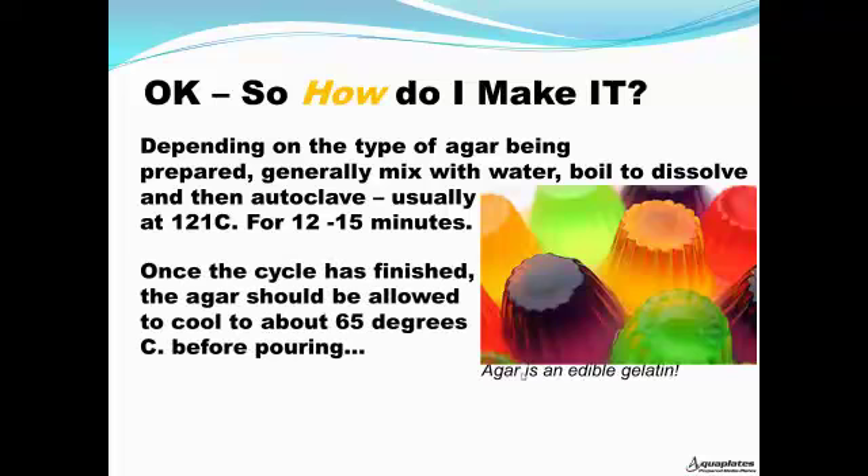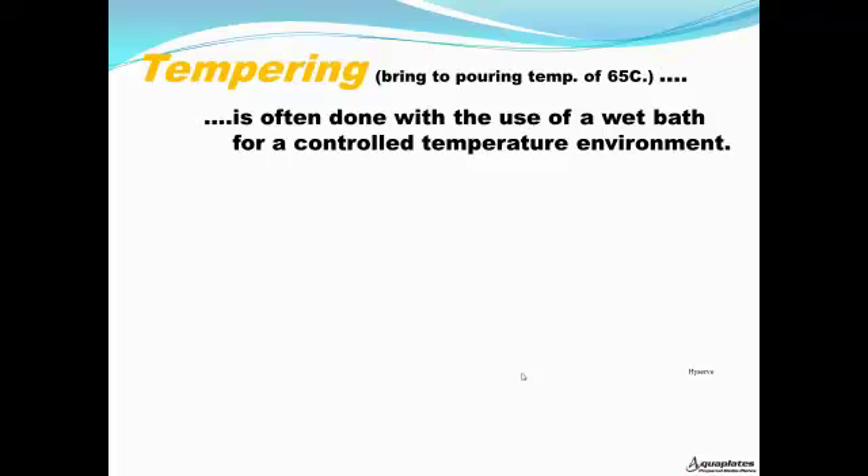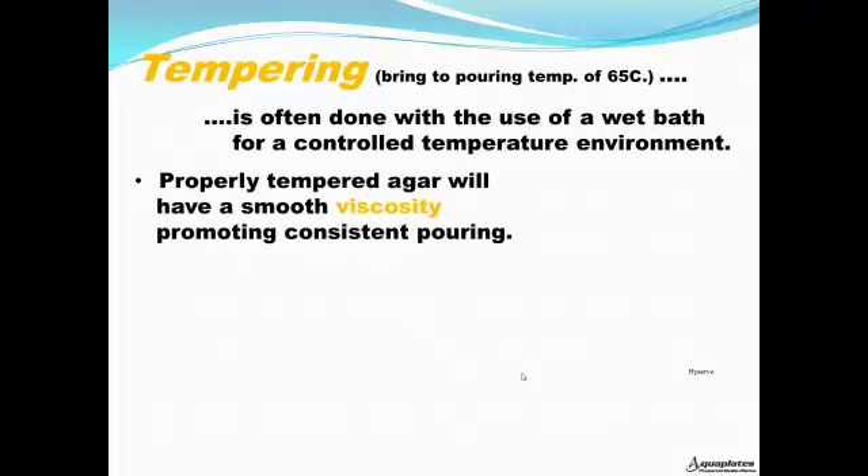Once the autoclave cycle is finished, the agar should be allowed to cool to about 65 degrees Celsius before pouring. This is called tempering the agar. Tempering, or bringing to pouring temperature of 65 degrees Celsius, is often done with the use of a water bath for a controlled temperature environment. Properly tempered agar will have a smooth viscosity, promoting consistent pouring.